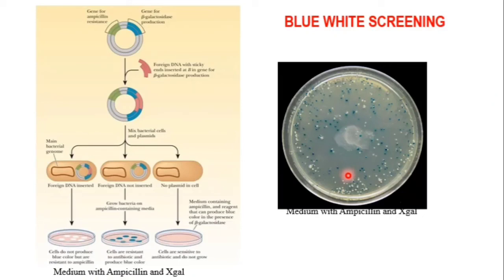So we can select this white colored colony as a recombinant clone, and this blue is because there is no insertion of foreign DNA in the lacZ gene. This is the blue-white screening method.